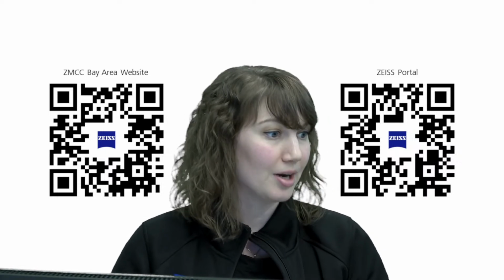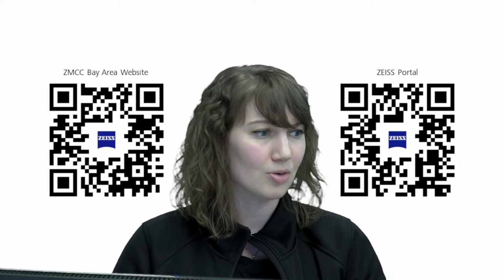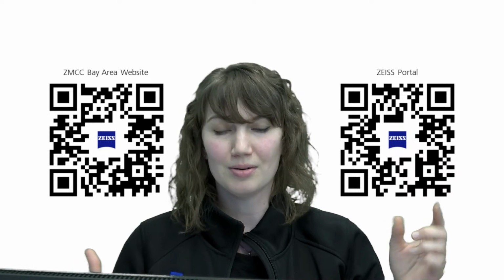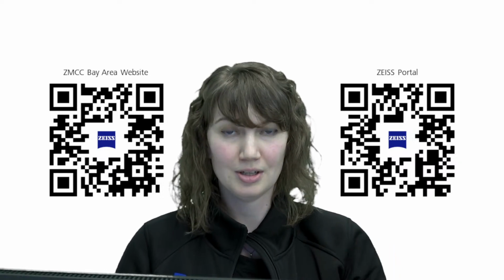Is there a technical paper I can learn more about this? Yes. I know we have a white paper that basically publishes what this is. So if you really want to go into the math and understand what math we're doing to get out all these readouts and do all those calculations, I know we have that published in a white paper, and that should be somewhere on our website.